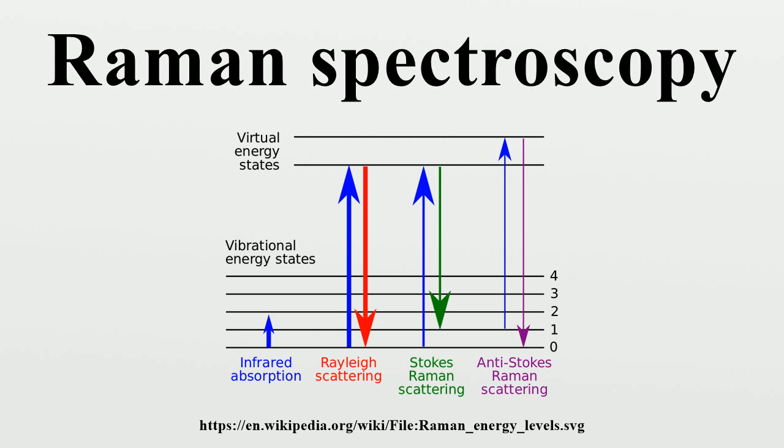Raman spectroscopy can be used to investigate the chemical composition of historical documents such as the Book of Kells and contribute to knowledge of the social and economic conditions at the time the documents were produced. This is especially helpful because Raman spectroscopy offers a non-invasive way to determine the best course of preservation or conservation treatment for such materials.